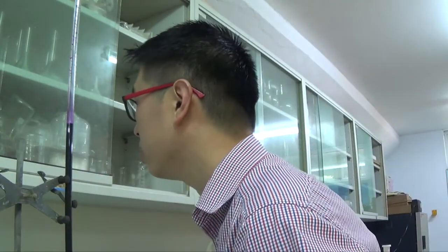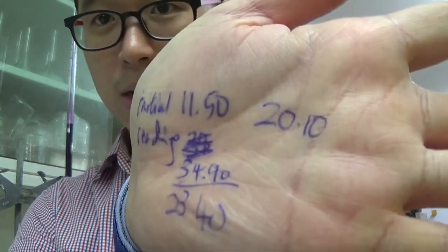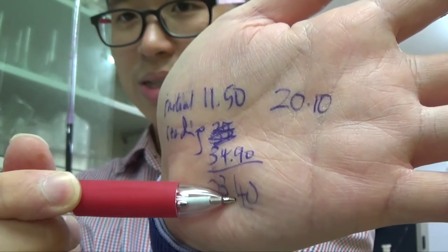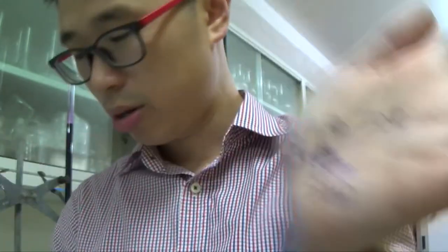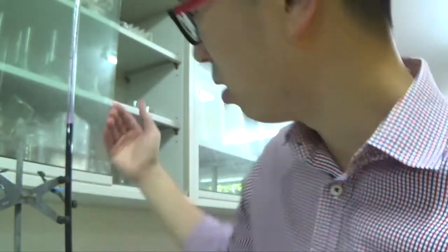Here, my initial reading is going to be 20.10. Okay, so remember I did a rough, but I did not include it here. 23.40 is the accurate titer. This is why I started with 20.10 right now. So this plus this should be my accurate titer. So 20.10 plus my accurate titer, 23.40. I know that was super accurate already, super accurate drop by drop. So I will just take away one cm cube. I take away one cm cube. So I know it's 42.5. So I roughly need to slow down around 42.50 cm cube, because it depends on what I started with.